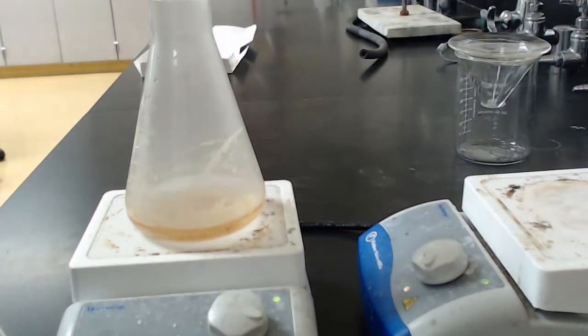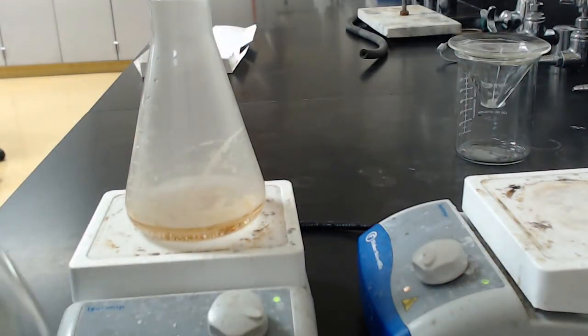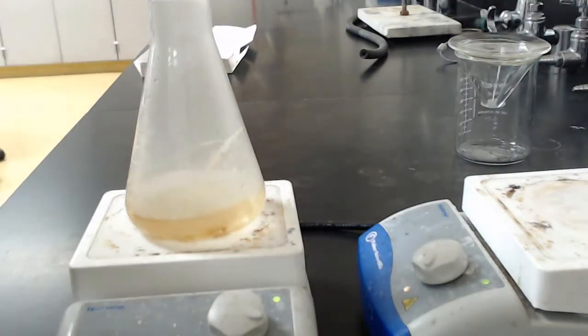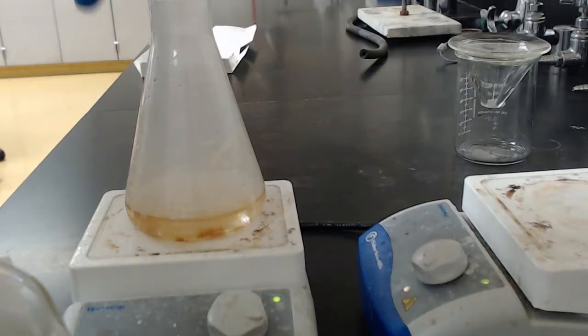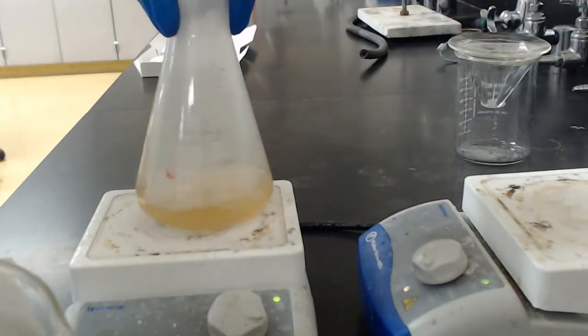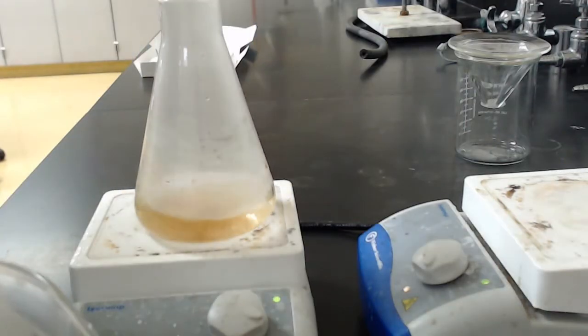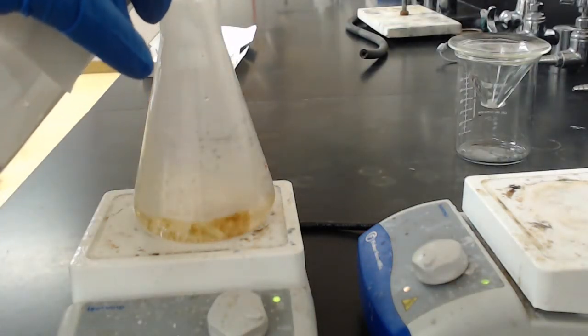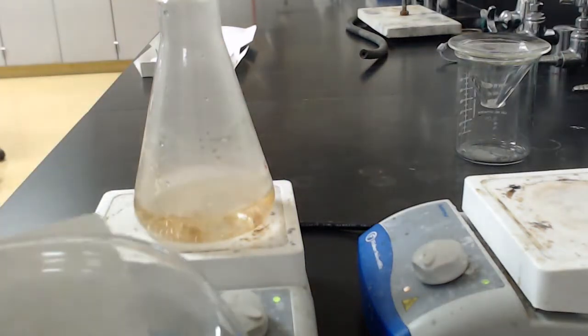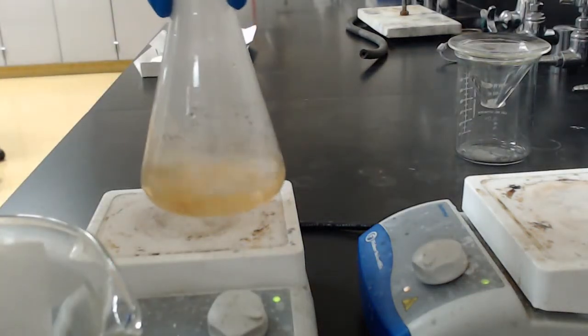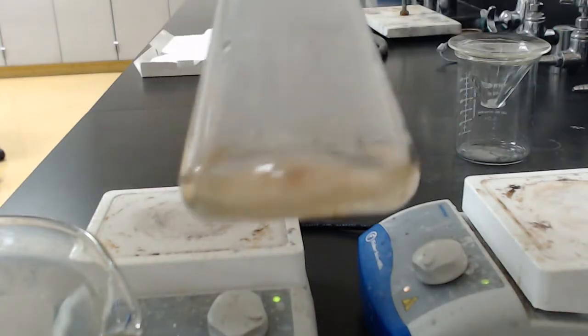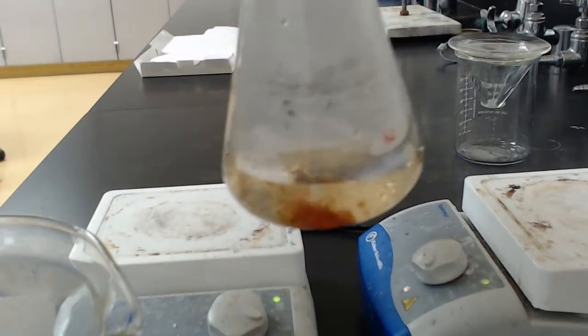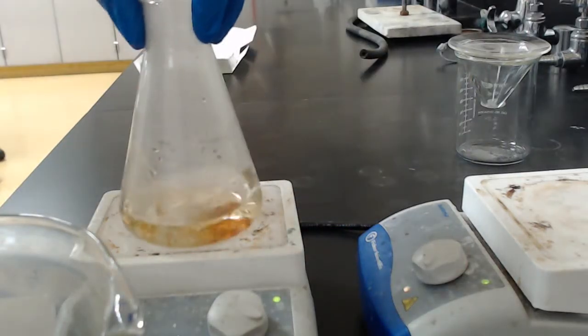If I let it cool down, the acetanilide will recrystallize out prematurely. I think I have enough in there. If you have too much water in there, it's not typically too big of a deal, just you may lose some of your material. But it's not the end of the world. With the aniline impurity, it's kind of hard to gauge exactly how much you need of the water. But this here, you see the oil droplets in there, that is not going to dissolve no matter how much water I add. So we have to get rid of it other ways.